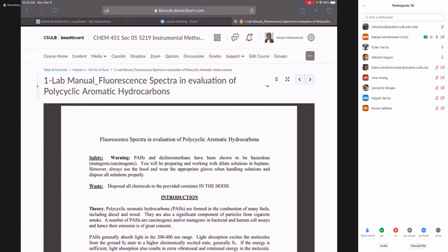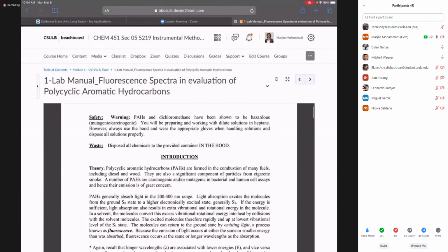If I remember it, what was the other two? Can I stop you there real quick? Sure. Real quick, because as I was doing an introduction and going through the experimental, I saw that it does say that we're measuring 4 polycyclic hydrocarbons. Exactly. But if we go to writing the report, it only talks about benzoanthracene. I'll correct that one. Thanks for noticing.